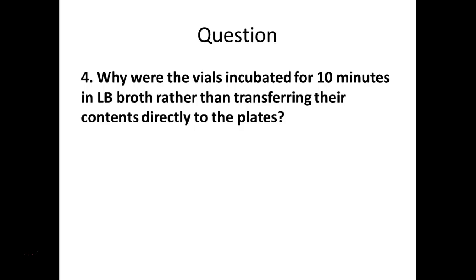So I want you guys to look at those plates for a second. What's the difference between some of those plates? Look at those labels. What's in those plates? So LB is the food, right? What else is in some of those plates? The antibiotic what? Ampicillin. And one of your plates also has the sugar arabinose, right?